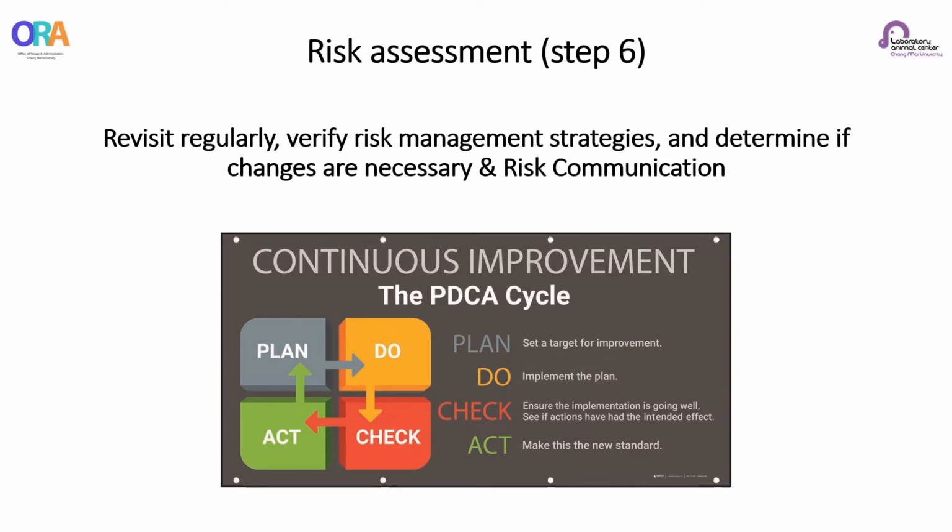And the last thing of risk assessment is risk communication. An effective culture of safety depends on the effective communication and reporting of risk indicators, including incidents and near misses, in a non-punitive manner. Institutions that work with infectious agents and toxins need an appropriate organizational and governance structure to ensure compliance with biosafety, biocontainment, and laboratory biosecurity regulations and guidelines, and to communicate the risks.